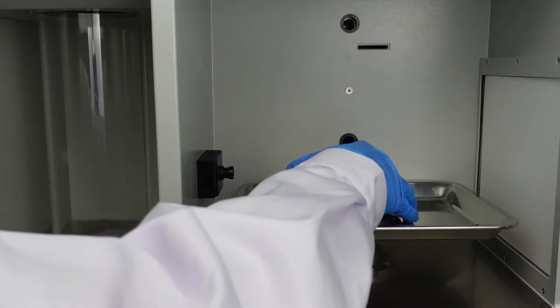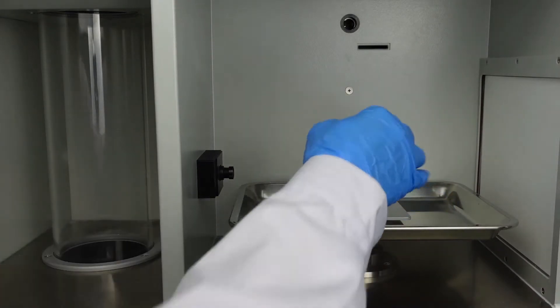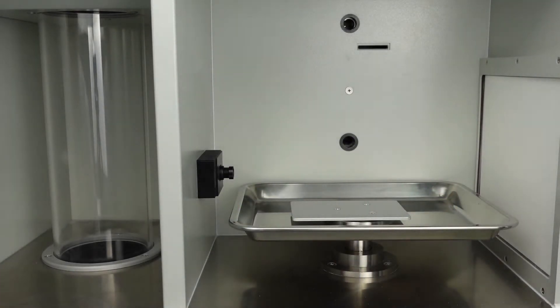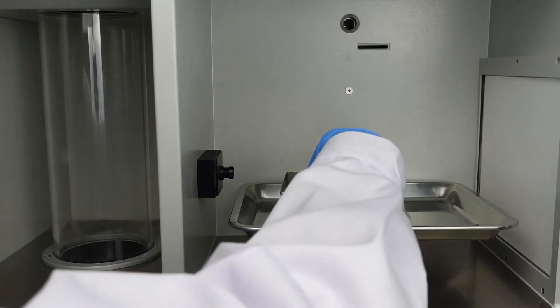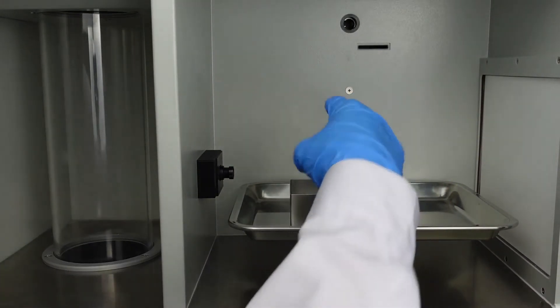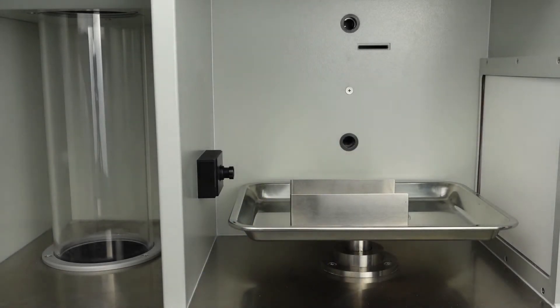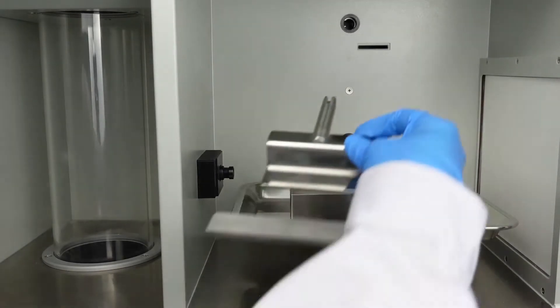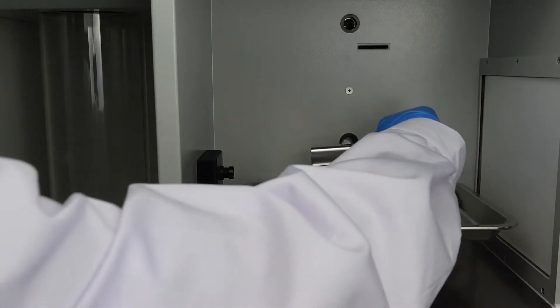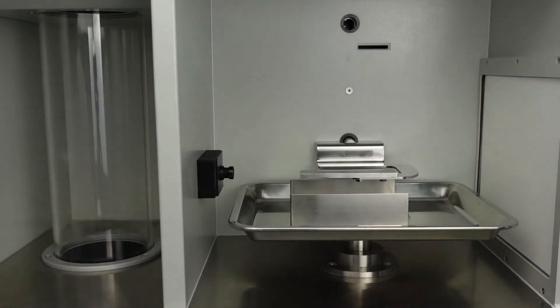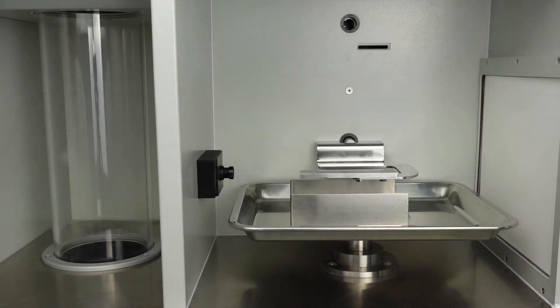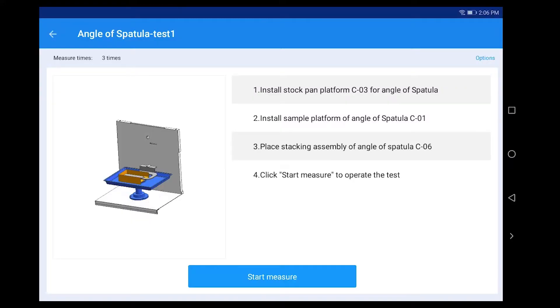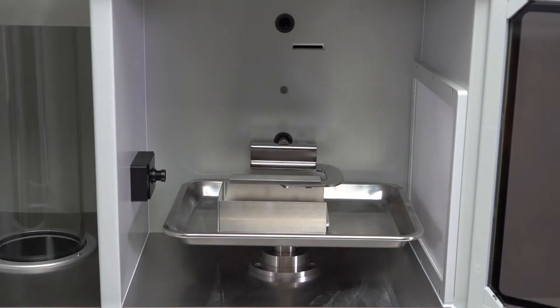Install sample platform of angle spatula C01. Place stacking assembly of angle of spatula C06. Click 'Start Measure'.